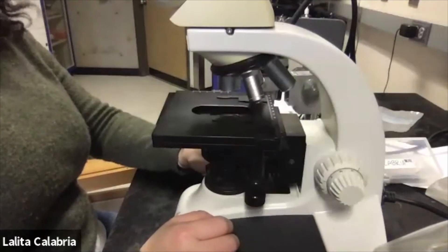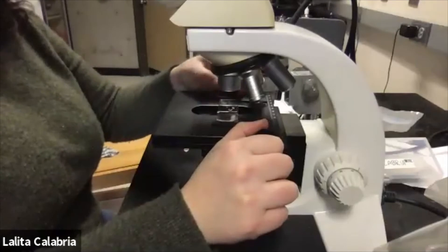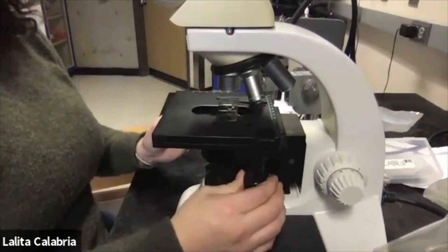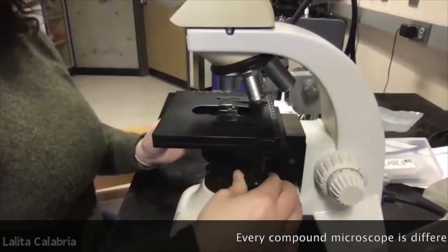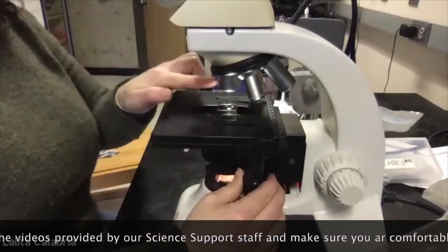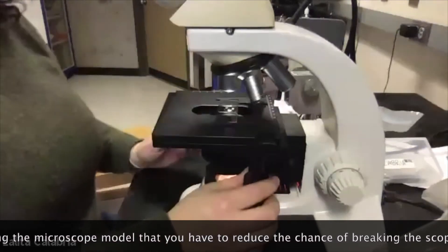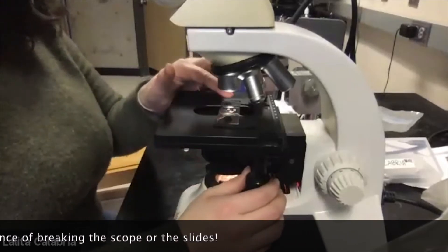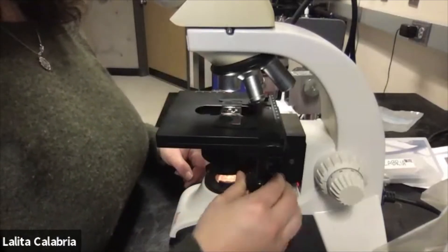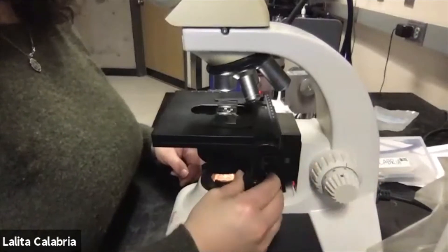Now for getting started with crustose lichen ID using the compound microscope: carefully fit your slide onto the stage and move the stage horizontally and forward and backward to position it over the light source and under the lens. Turn the light on. The turret should be set so the smallest lens is over the slide — you never want the lens to bump into the slide — so start at your lowest magnification. Look in and scan in and out until you're in crisp focus.